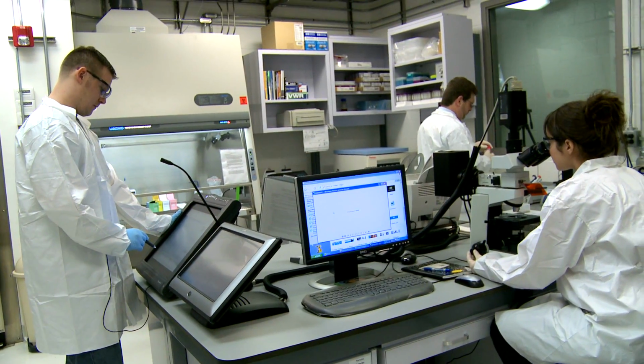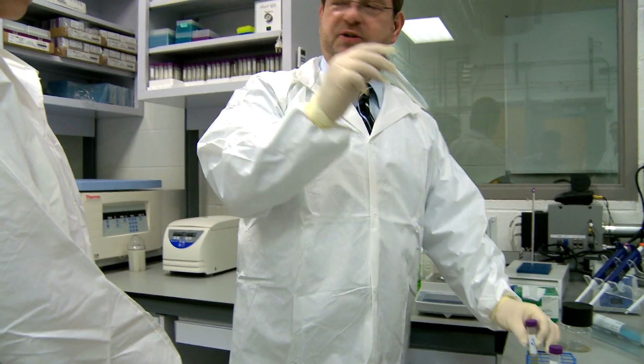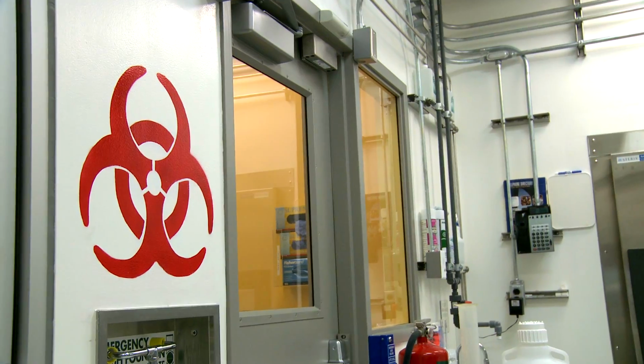And as I indicated, I think it's important to recognize that we train in the absence of harmful microorganisms. Almost every other level 3 laboratory is a hot lab. It's filled with infectious microorganisms that cause substantial human disease. So you do on-the-job training. And probably the worst thing you could hear in the hot lab is, oops. So even if you hear oops in our lab, there are no severe consequences with respect to infectious disease.